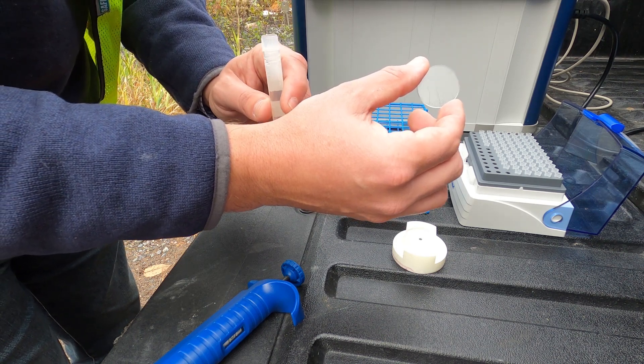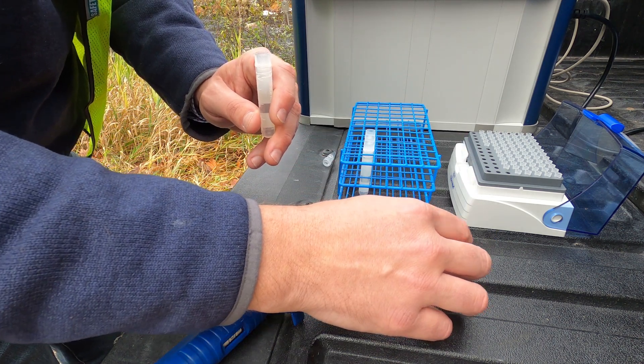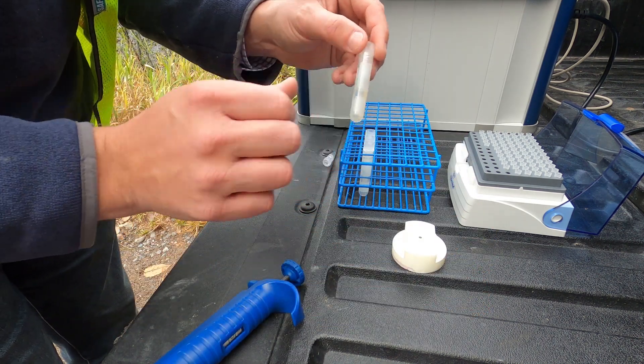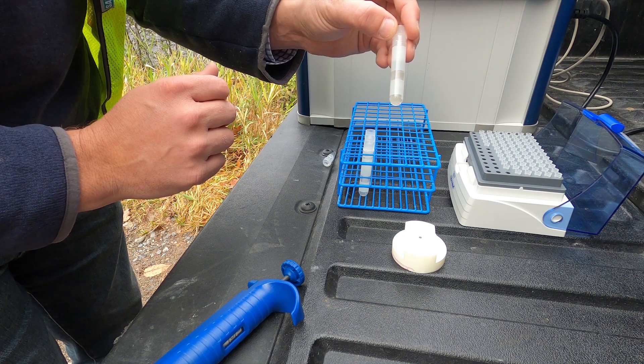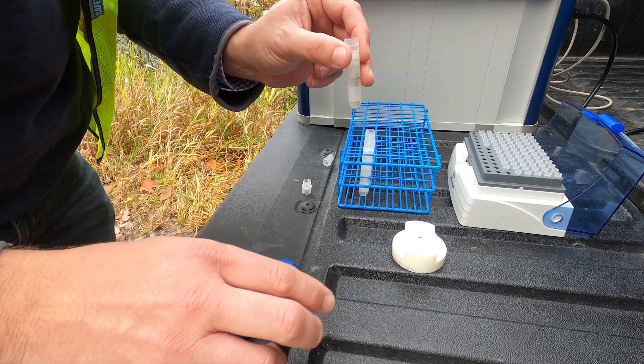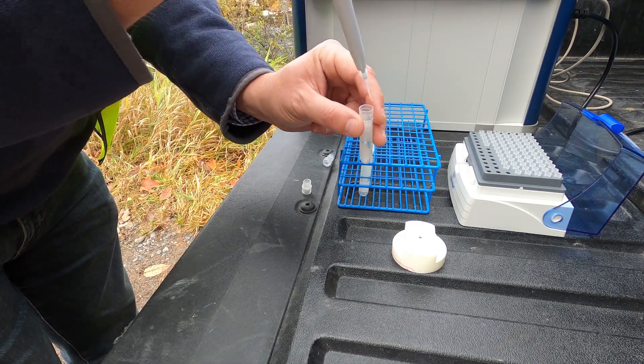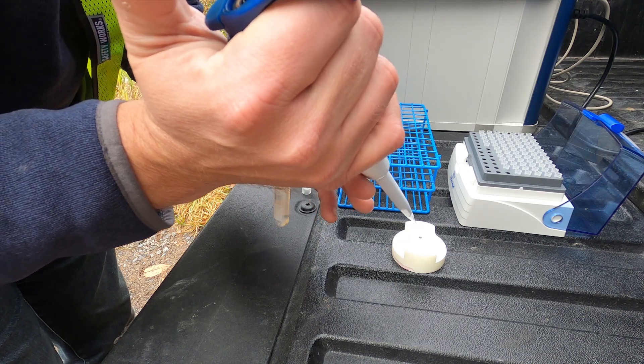There are also options to use quartz or sapphire sample carriers. Now that we have our internal standard in our water sample, we will pipette five microliters of water onto our sampling disc.